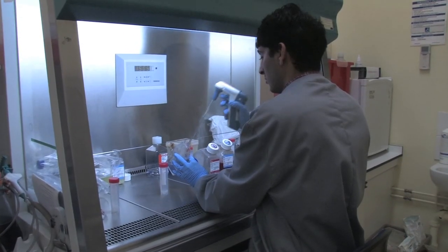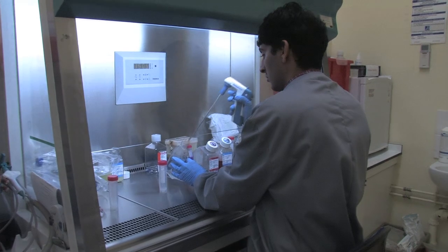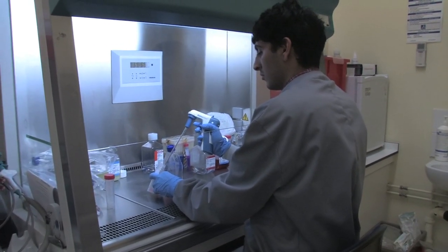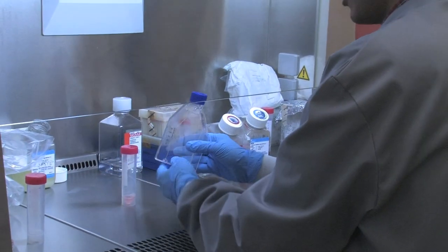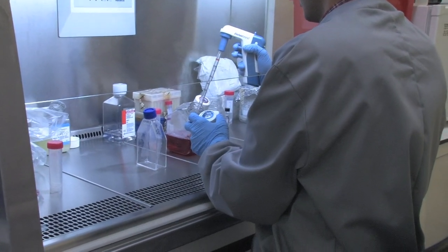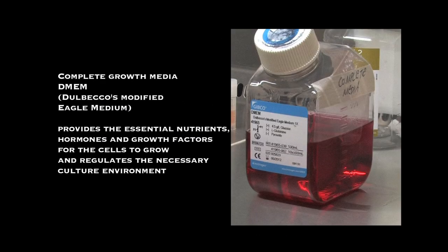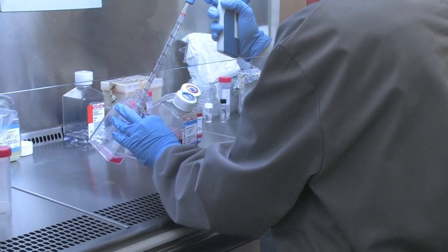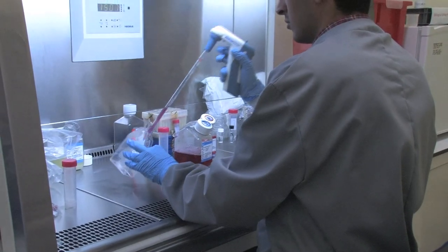Once more than 90% of the cells have detached from the bottom of the flask, they are then transferred into a sterile tube. To ensure all of the cells have been transferred, the flask is rinsed with pre-warmed complete growth media. The amount of growth media added is twice the trypsin volume used initially, and is then transferred into the same sterile tube.